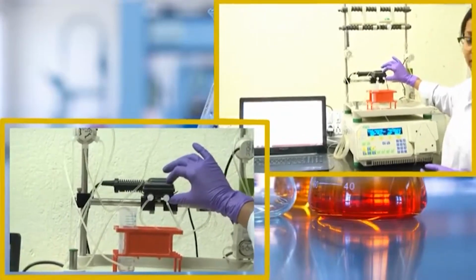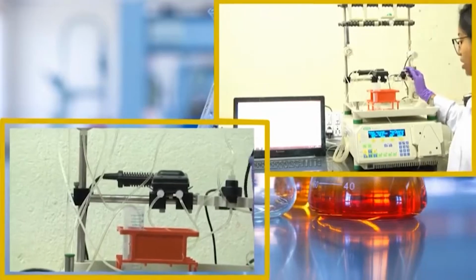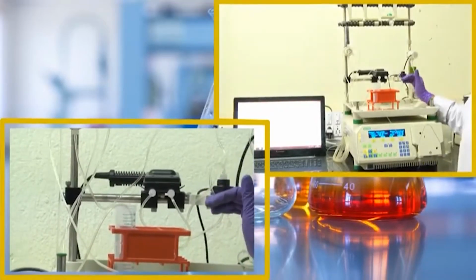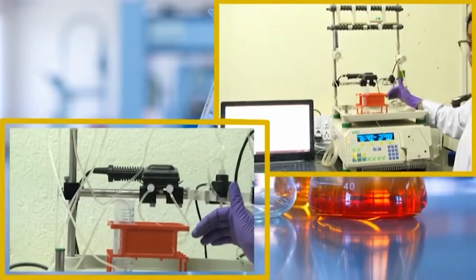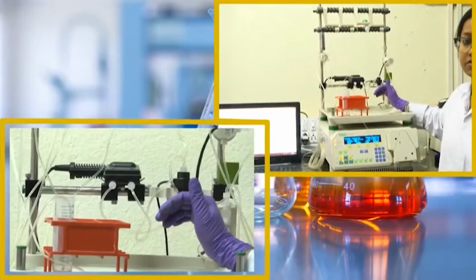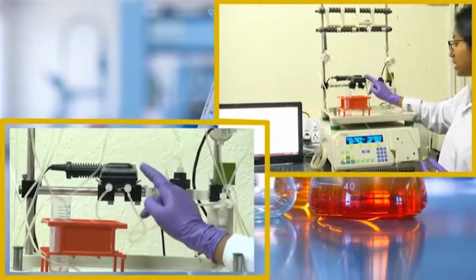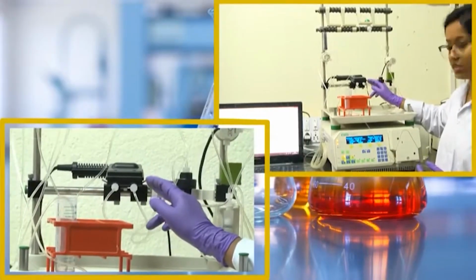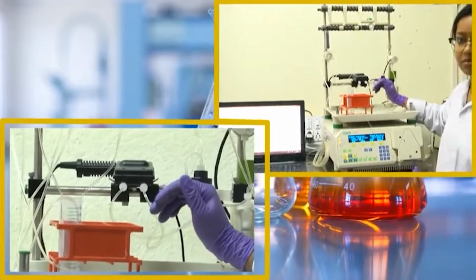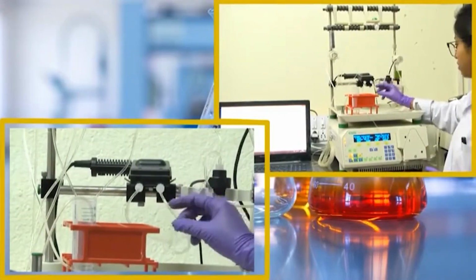This is a UV light chamber, and it measures the absorbance at 280 nanometer. This FPLC system, as I have mentioned earlier, is made for protein purification. Most proteins which have tryptophan and tyrosine residues absorb at 280 nanometer. So it will take the absorbance measurement at 280 nanometer, and if any protein is there, it will measure that absorbance.